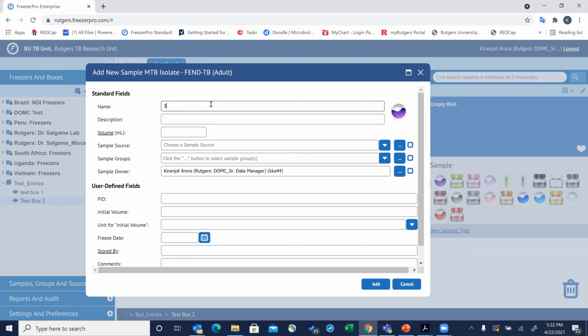So it starts with 3 dash, and based on the clinic, it's either UK or UR in Uganda, and then I think it's a ZN for South Africa. But let's go to the UK, Kasinia side in Uganda, and then dash 1001.